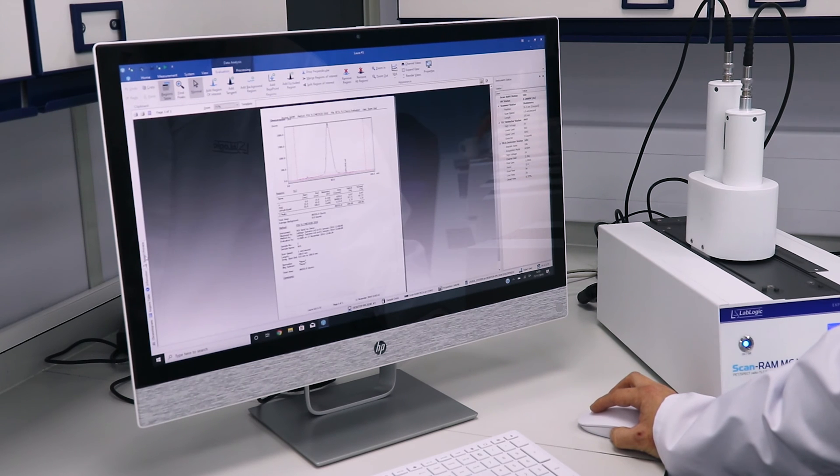All ScanRAM models are controlled by LabLogic's market-leading software Laura for Pet which is used in hundreds of radio pharmacies worldwide. It's simple, easy to use and has all the features available for you to achieve regulatory compliance.